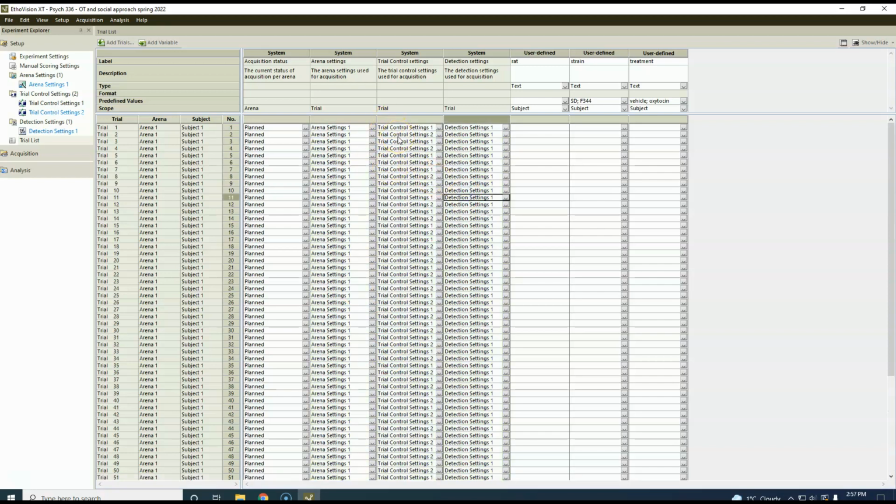Okay, all right, so that's it for setting it up. I'm going to probably run a rat just to test it, make sure everything works, and I will make a video of that as well. But this at least gets us through everything that we're going to be doing.